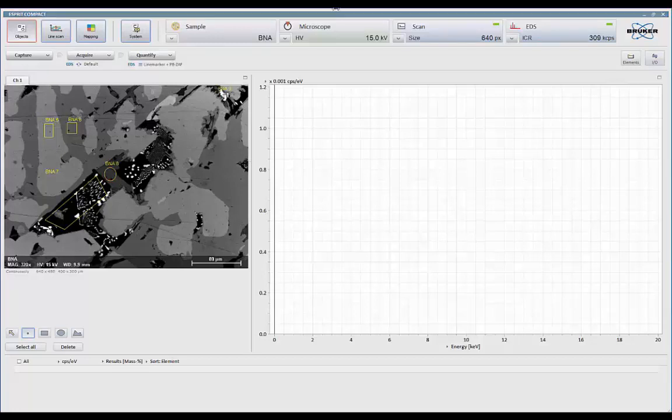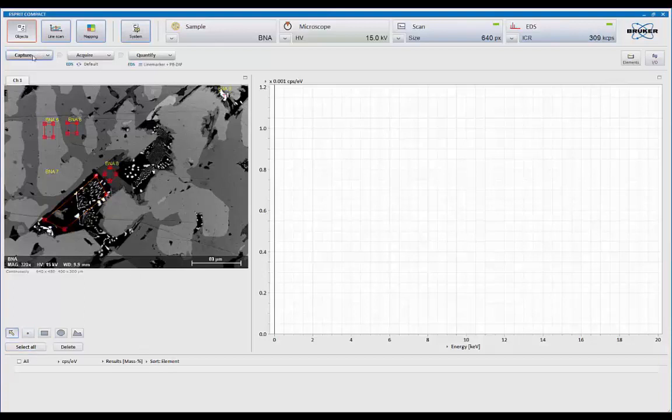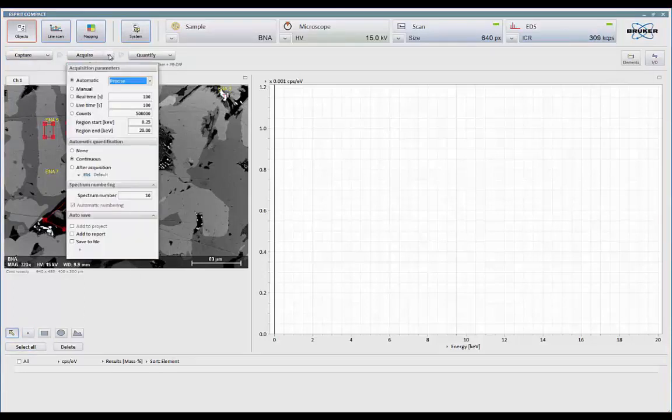So I can just go in here and quickly click on a particular region or point that I'm interested in. So with that, I've set up five points. I'll select all. Go to acquire.